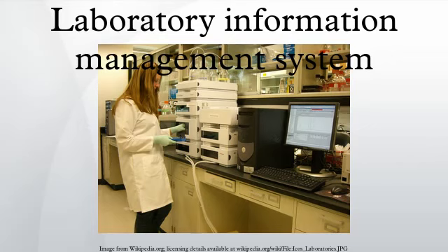Configurability. LIMS implementations are notorious for often being lengthy and costly. This is due in part to the diversity of requirements within each lab, but also to the inflexible nature of LIMS products for adapting to these widely varying requirements. Newer LIMS solutions are beginning to emerge that take advantage of modern techniques in software design that are inherently more configurable and adaptable, particularly at the data layer, than prior solutions. This means not only that implementations are much faster, but also that the costs are lower and the risk of obsolescence is minimized.